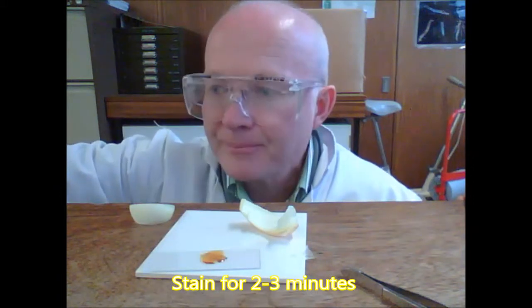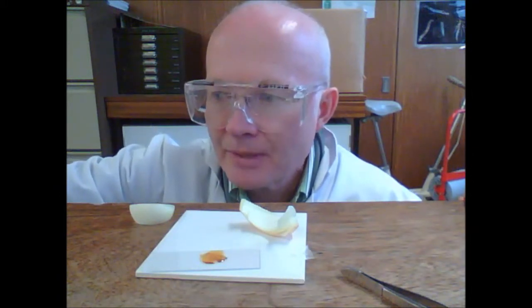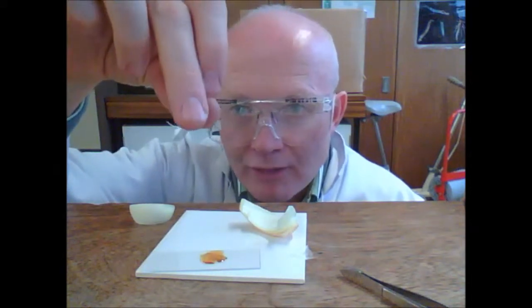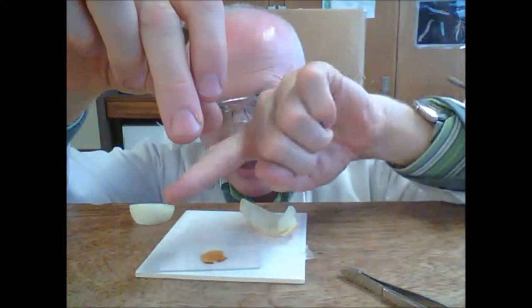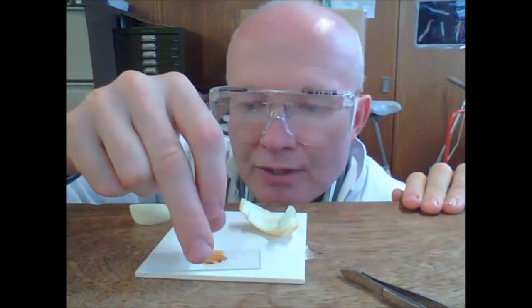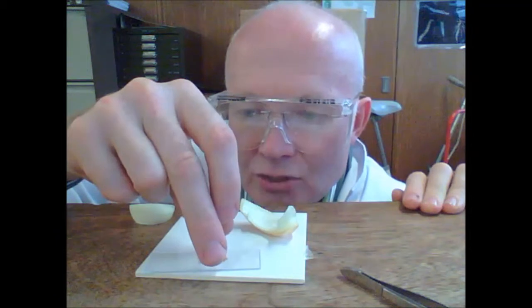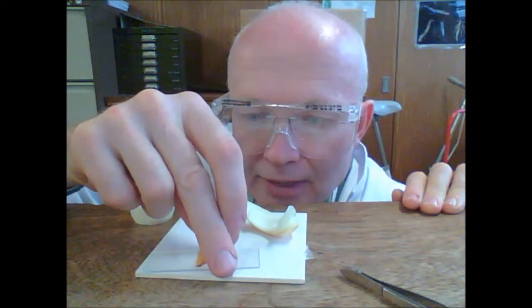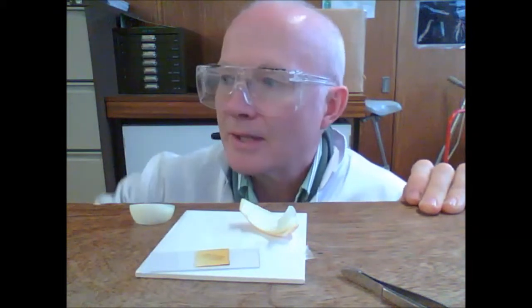After that time, you can take a cover slip. Take your cover slip and put it in at about 45 degrees, so the cover slip is coming in at a 45 degree angle. Get it to touch onto the surface, the edge of the stain, and then lower gently down. That way you will not get any air bubbles under there.